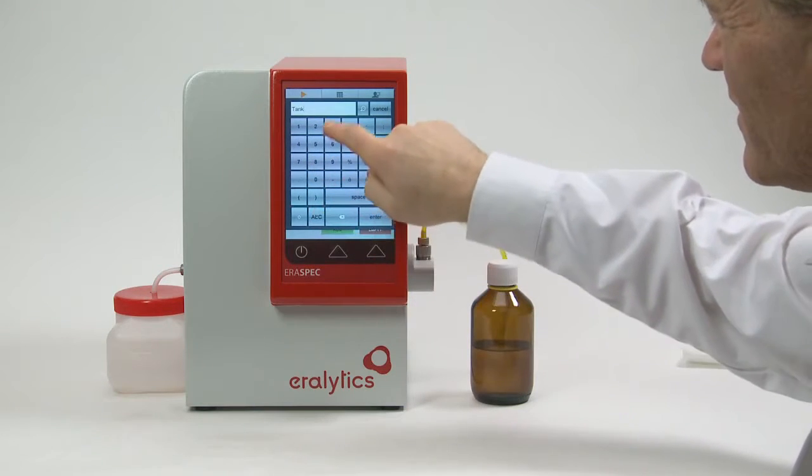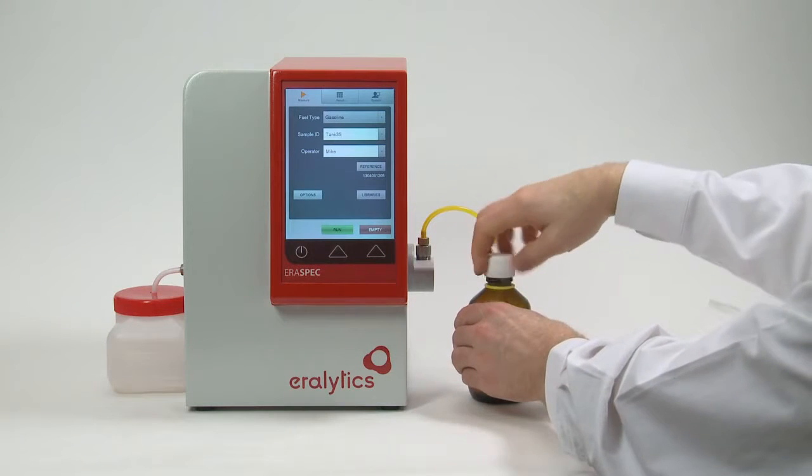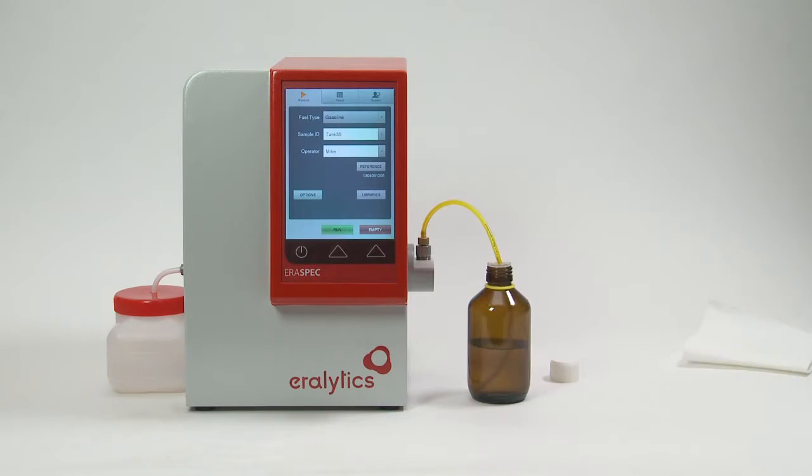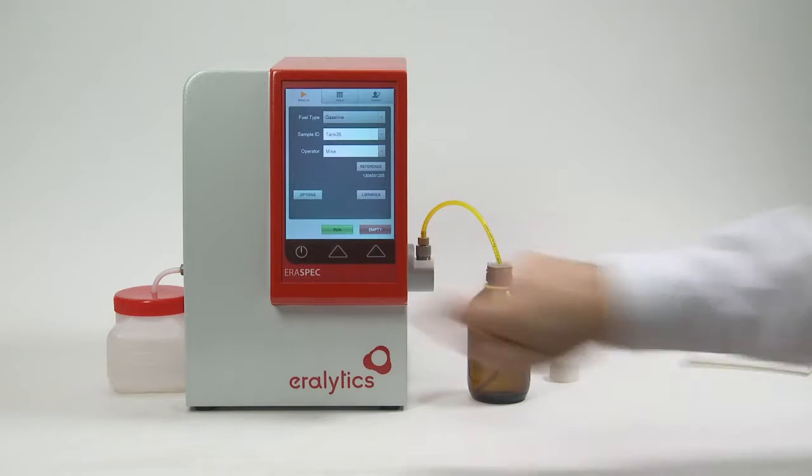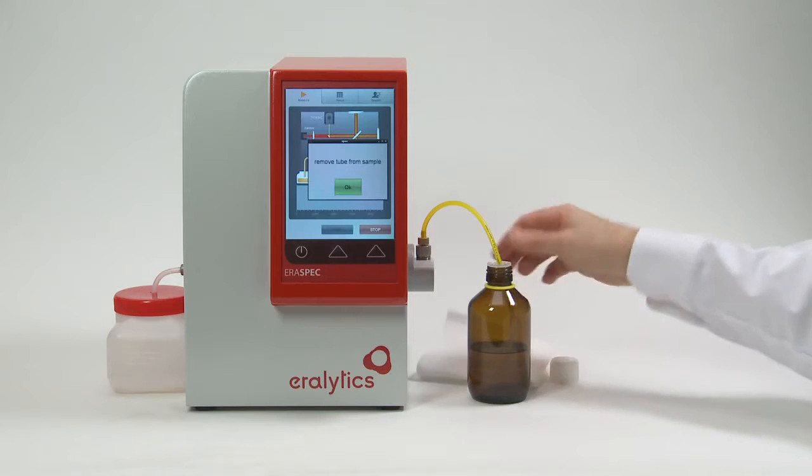Enter the sample ID and the operator on the pop-up keyboard or select them from the drop-down list of previously entered names. Then insert the filling tube into the sample container and press Run. The instrument automatically draws in about 12 to 15 milliliters sample to rinse and fill the absorption cell and the built-in density meter. At the same time, the IR source is switched on.